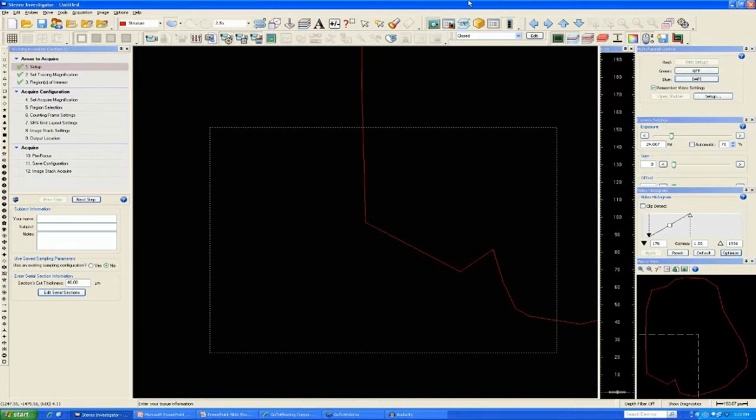Okay, Sebastian is asking about having multiple regions of interest in the same section. Well, Sebastian, the way that our software works is that we use specific contours for specific anatomical regions.